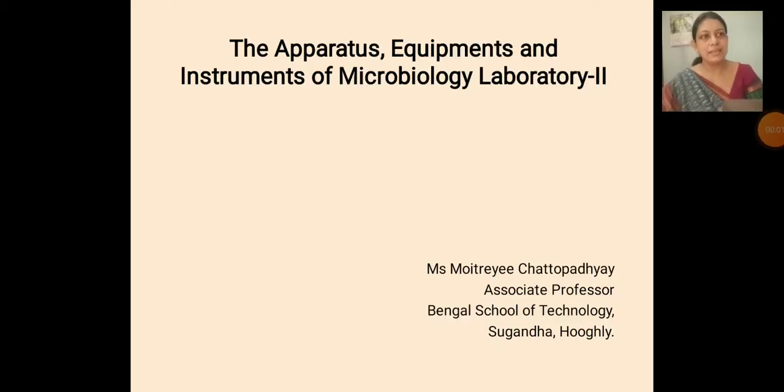Dear students, I will be beginning with the second part of the apparatus, the equipment and instruments that are required for the microbiology laboratory. In the previous discussion, I had spoken about the glass apparatus, the metal apparatus and various instruments, the small instruments and equipment that are used for microbiology practicals.